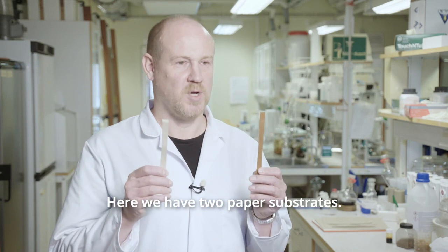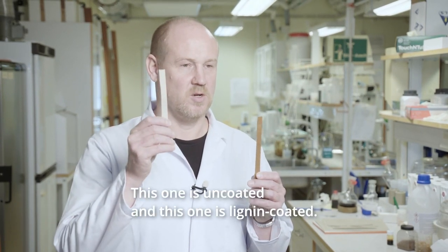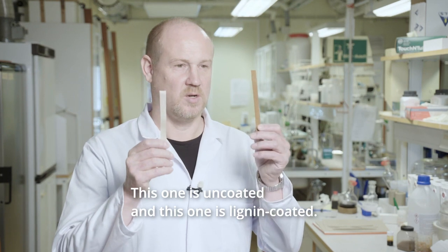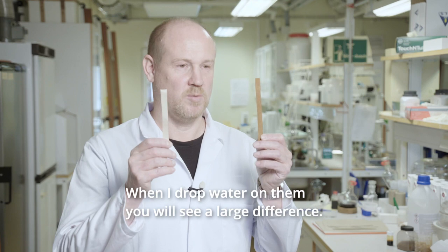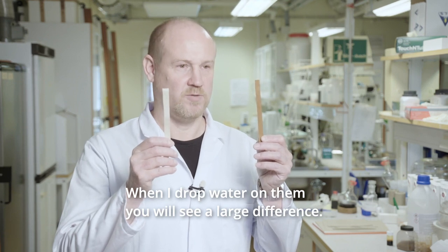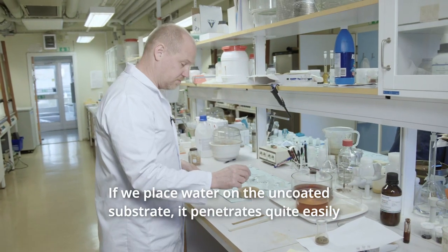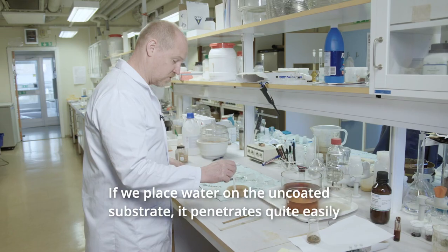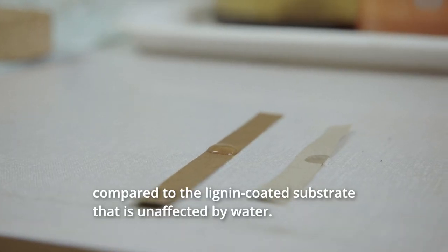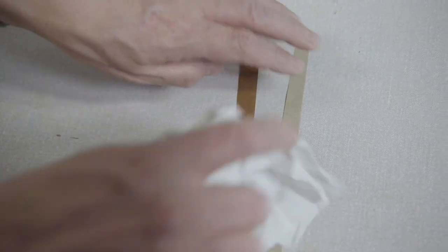Here we have two paper substrates. This one is uncoated and this one is lignin coated, and as you will see when I drop some water onto them, you will see a large difference between the two. If we place water onto the uncoated substrate you can see that it penetrates quite easily, compared to the lignin coated substrate that is unaffected by water.